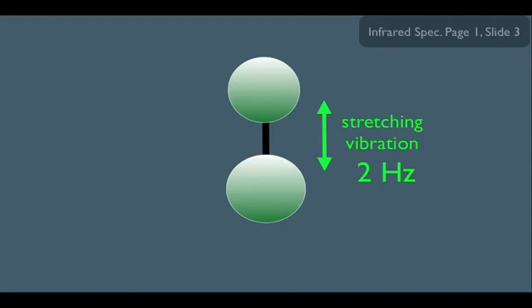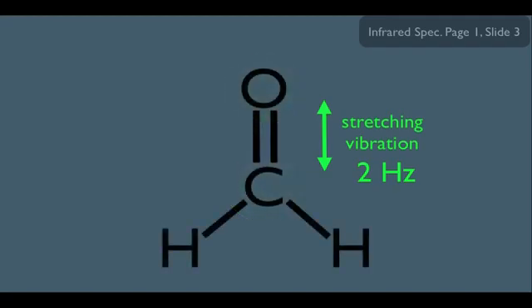Let's say we start at this position. The 2 hertz means that it'll stretch 1 like this, and then 2 cycles per every second. Now, keep in mind that's not the reality. It actually vibrates at a much, much higher frequency, but let's keep the number simple for now. And also, just a side note here, of course the vibrations would be temperature dependent, but let's just assume room temperature for our example.